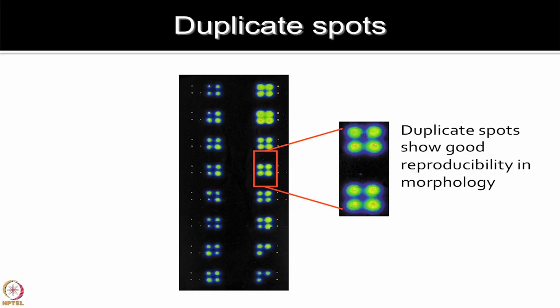You also want to see how good your replicated spots look, how reproducible they are, and this is shown in this slide, which looks pretty good.